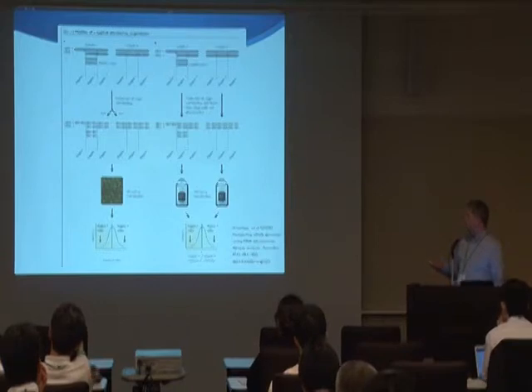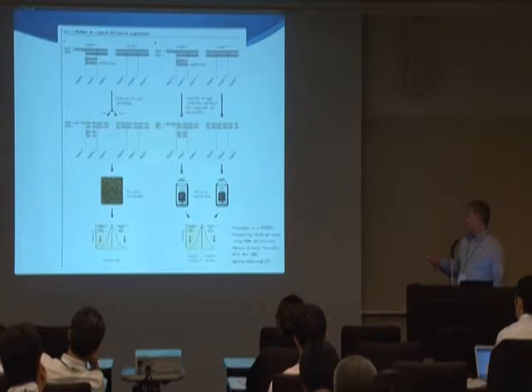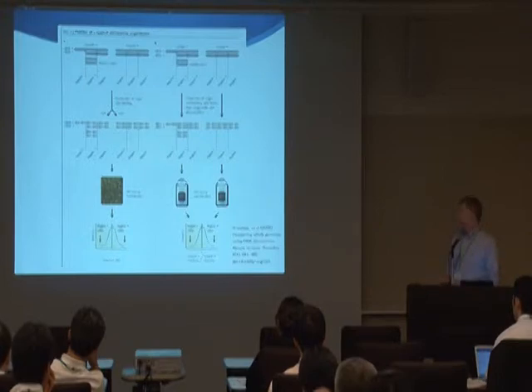The Affymetrix modality, of course, uses your target sample with all the fragments labeled with biotin and then streptavidin and phycoerythrin. This gives you a single color hybridization, which can then be read off the chip and compared to a reference pool of samples.